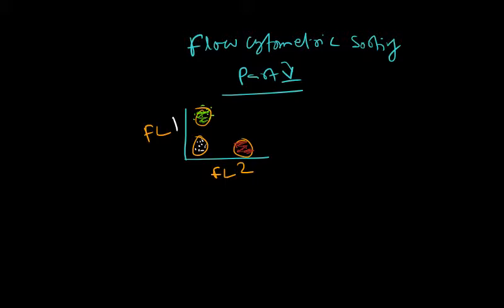That means this is a sample where it's a heterogeneous population, where we have a population that is showing stain for one fluorochrome, or that is expressing one particular protein. The other group of cells are expressing the other kind of protein, and then we have some cells which are not expressing either of the proteins. So the sample here is a heterogeneous sample.